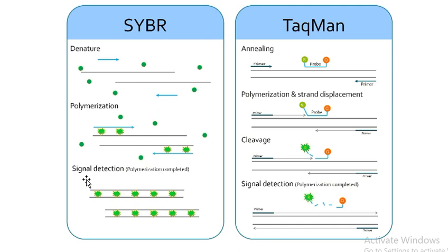Here we will have the SYBR green fluorochromes, we also call them cyber fluorochromes, readily binding to the hydrogen bonding. So at the end of this reaction, from the beginning to the end, we know what process a PCR reaction is going through, which is not possible in the conventional method. And this is what exactly we have, the upper hand.